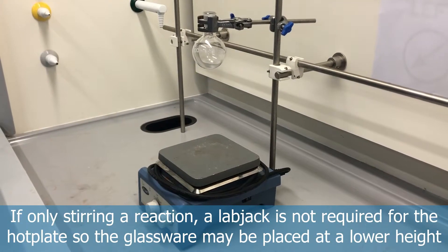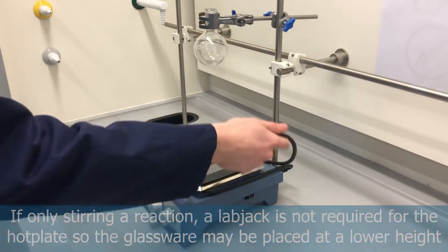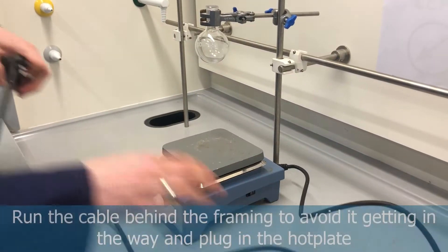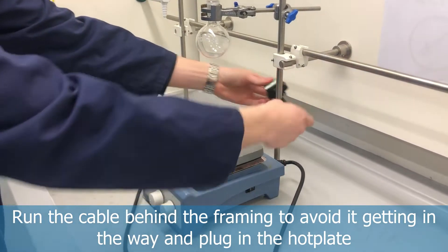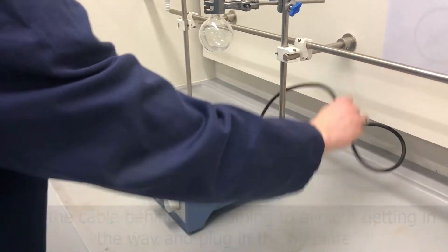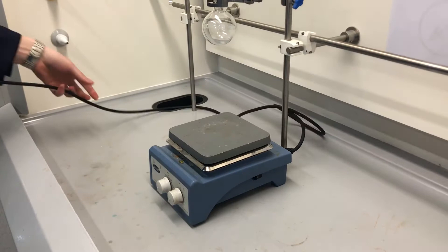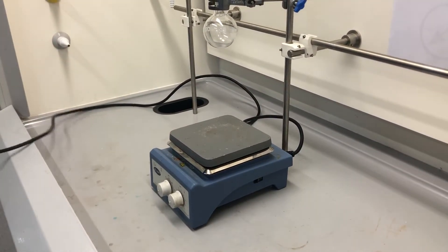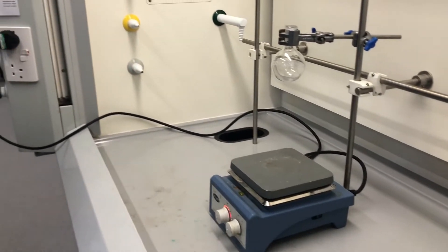If we're only stirring our reaction vessel we don't need to put a lab jack underneath it, as that's only really for raising and lowering the heat. So we can leave it on the floor of the fume hood. We'll make sure it's plugged in at the back of the stirrer and then wind the cable around the framing, which removes it out of the way of any glassware and, as we'll see later, stops it from getting tangled in the lab jack.